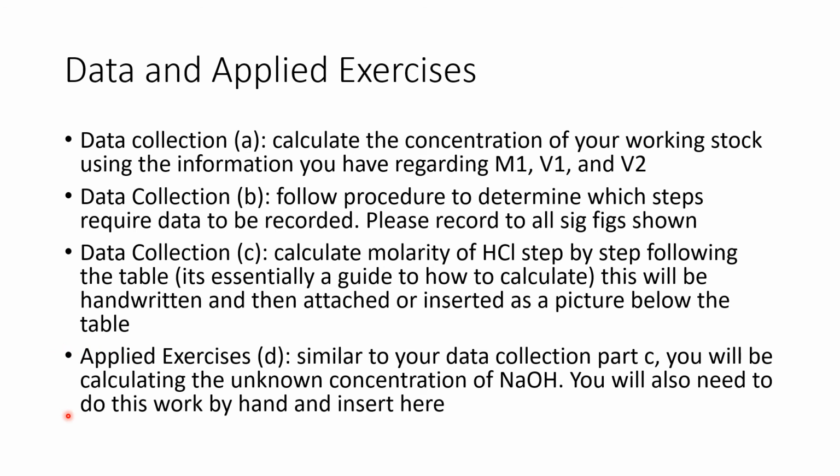And then finally, you will be doing this entire process again without actually having to do the titration on Virtual Lab. I gave you a problem where I give you the volume that was consumed to titrate a base with an unknown concentration, and you have to do the same thing you did here. If you need some help in terms of how to calculate this, go back to the video from chapter 4 that has to do with acids, bases, titrations, and neutralization reactions. In that video, I show you an example of how to calculate this.